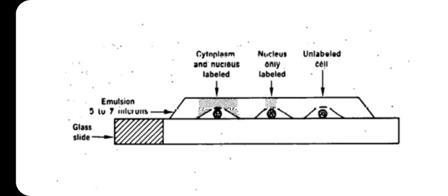Okay, you have used a certain chemical and there is a complementary molecule in your nucleus, then this radioactive element will go and bind to the nucleus. You have used another radioactive element which has a complementary molecule in the cytoplasm, so it will go and bind to the cytoplasm. There will be binding in the cytoplasm, there will be binding in the nucleus.